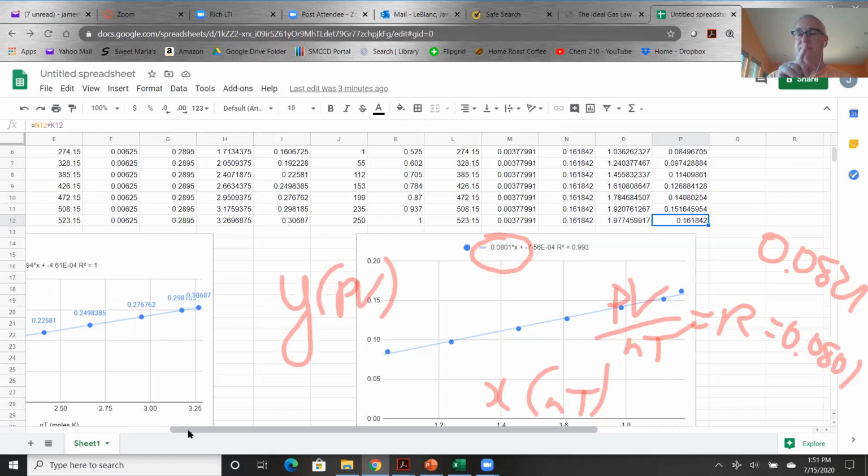The other thing you can do is, if we get this value for this amount of argon at a particular pressure, change the amount, change the pressure, run it again, and see if you get the same value of R. So it looks like you may or may not get exactly the value of R. You're going to get close. So do all three, and then in your discussion, discuss why they could be different.